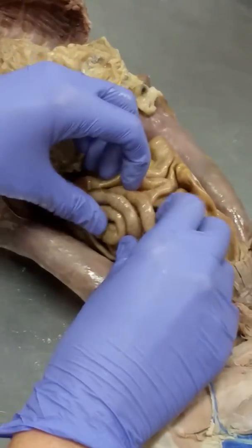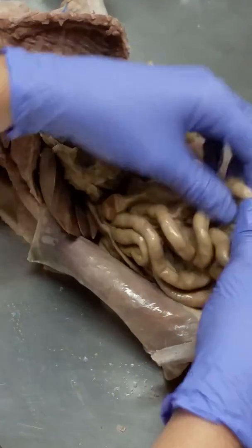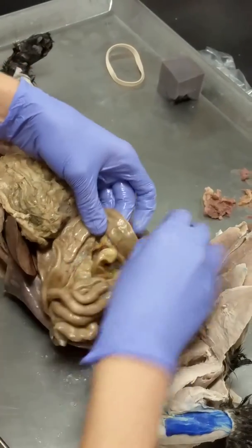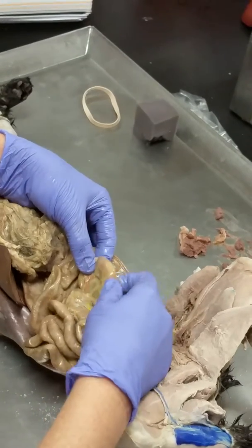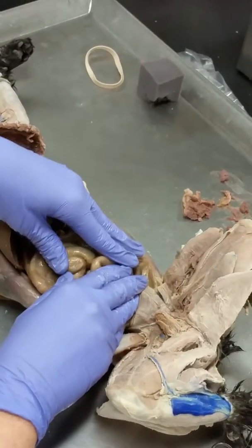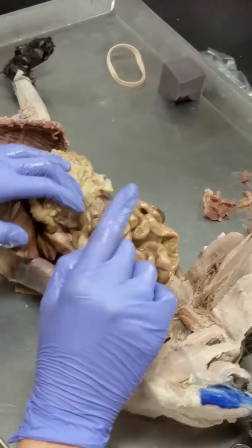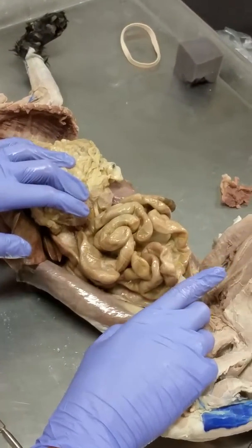Small intestines are called small not because they're short, but because they have a small diameter. So this is small intestine on this cat. It has a really small diameter. Where if we look at large intestine, it has a much bigger diameter. So can you see the difference between those two? Small intestine is actually the one that is a lot longer, okay? But it's small because the diameter is small. And duodenum is the first part of our small intestine. The other two parts are called the jejunum and the ileum.